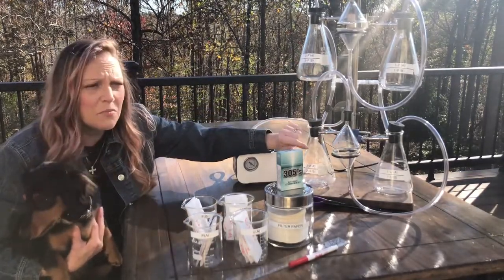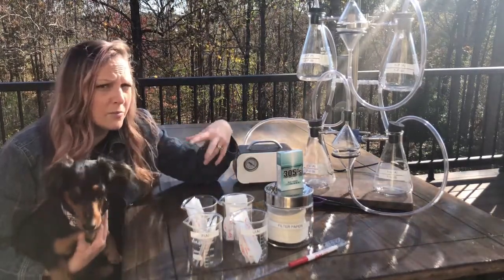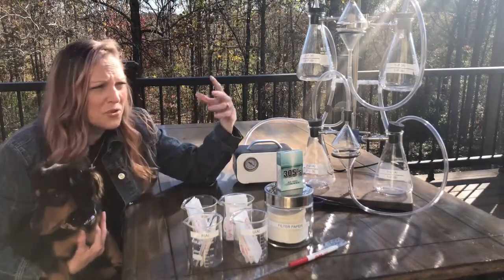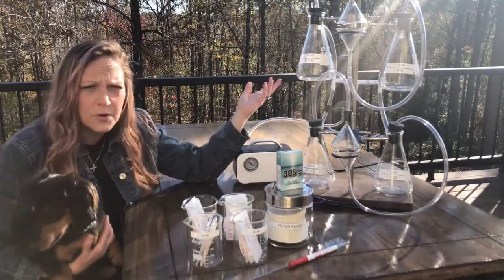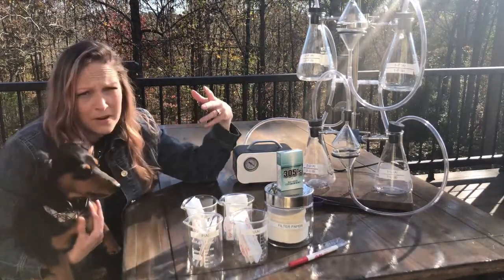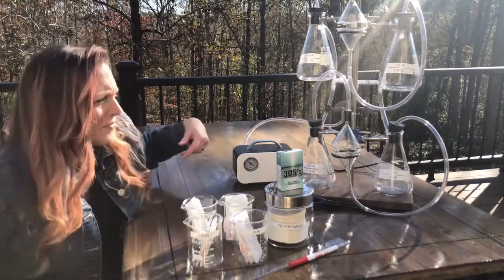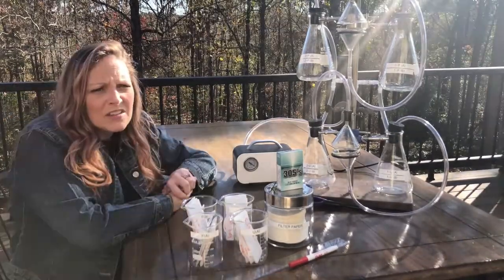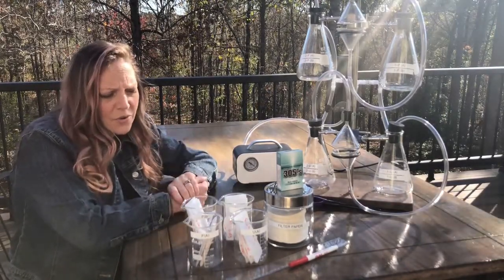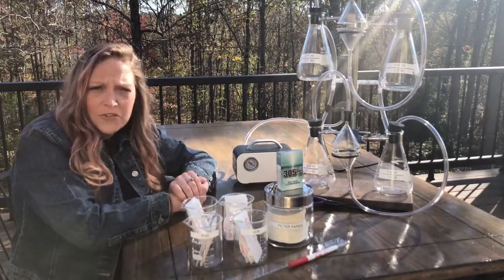And we're going to test both first-hand smoke, like what would be consumed by a smoker him or herself, and second-hand smoke, which would be what's consumed by those of us who are in the presence of someone who is smoking. Now, when we were growing up, your parents and me, people our age, smoking was everywhere. So smoking is a lot less common these days, and it was actually really hard for me to find any unfiltered cigarettes. So I kind of had to doctor some. I took a filtered cigarette and I pulled the filter off the end.